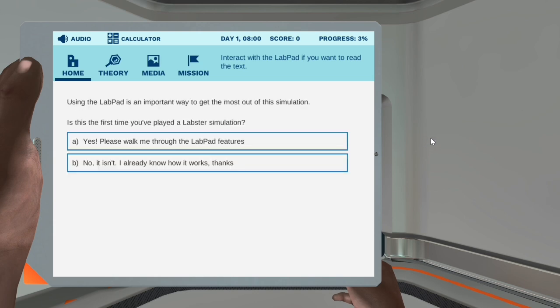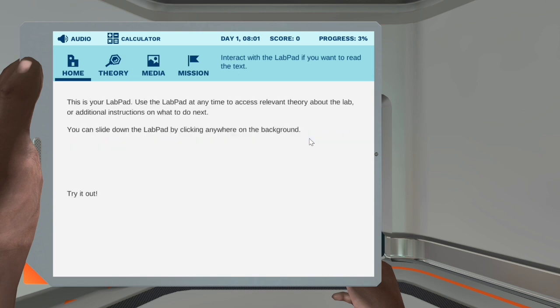Using the lab pad is an important way to get the most out of this simulation. Is this the first time you've played a lab simulation? Option A: Yes, please walk me through the lab pad features. Option B: No, it isn't — I already know how it works, thanks. This is your lab pad. Use the lab pad at any time to access relevant theory about the lab or additional instructions on what to do next.